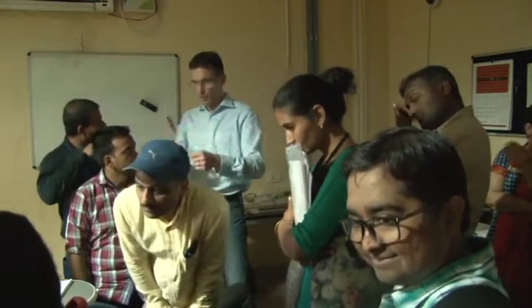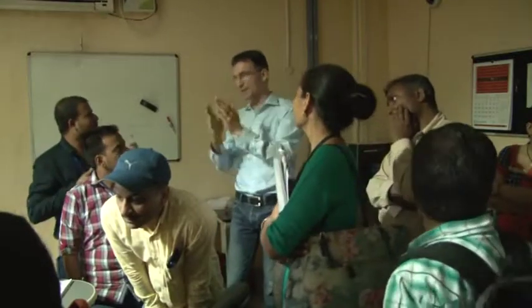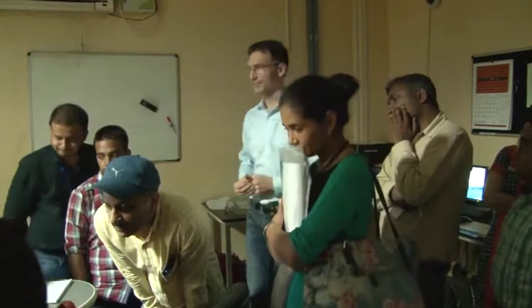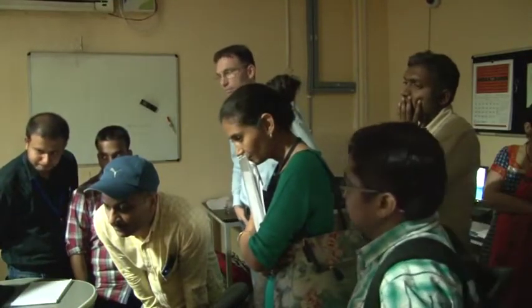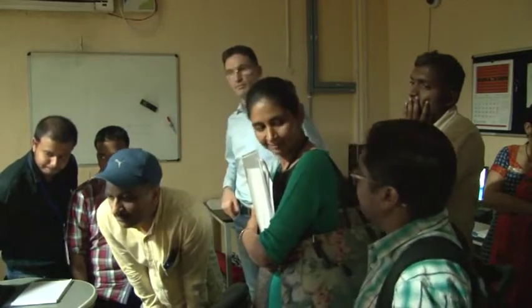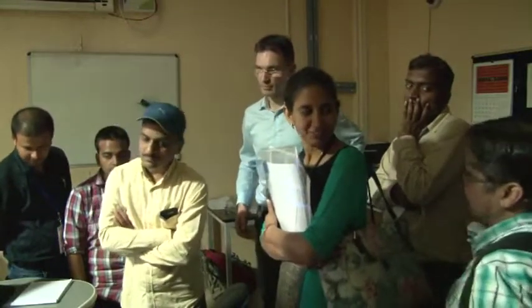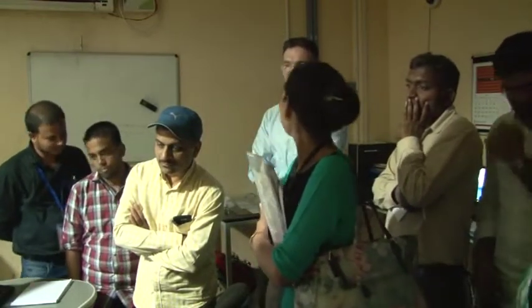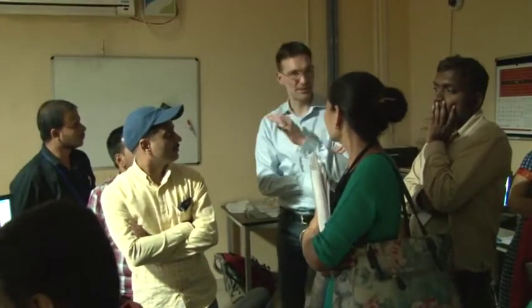I mean, these are just rows of atoms. Oh, the lattice. Yeah, but this is only one color of a plane. But probably you shouldn't spend too much time on this right now. I mean, you already saw, let's say, the principle.